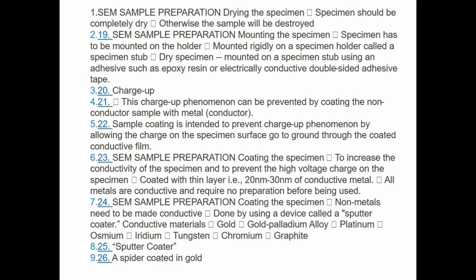If you want to see the microstructure, first you should do the sample preparation. After the preparation, you have to engage your sample with the machine, so that only then you can see the microstructure and other things. If you have newly developed any alloy, elemental analysis also you can do. No, not XPS. That X-ray we are taking, that EDX analysis is possible. That is also elemental analysis, line analysis, point analysis are available.